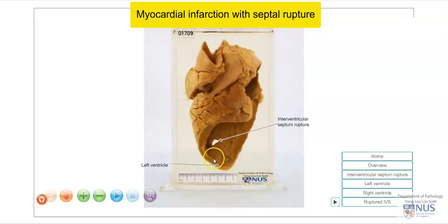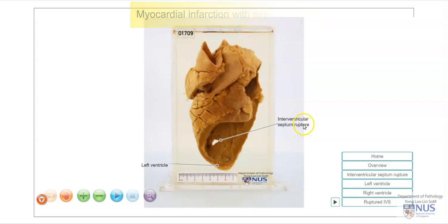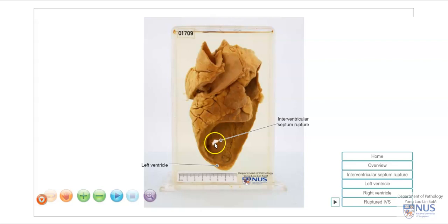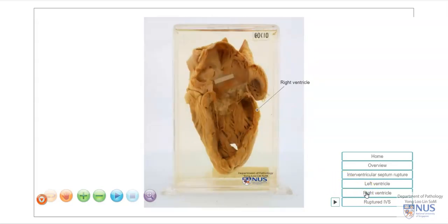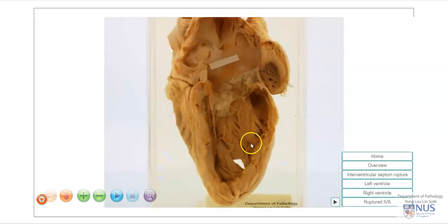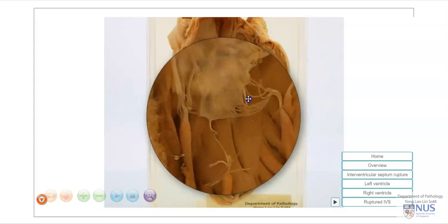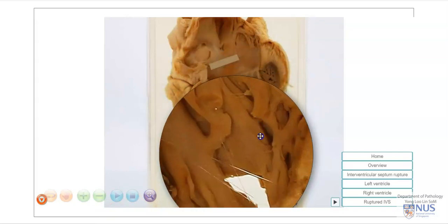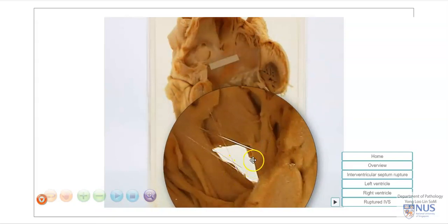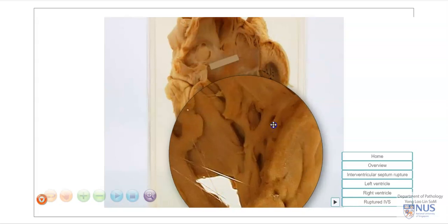Here we can see the left ventricle, and here is the area of rupture of the interventricular septum with a full thickness defect leading to the right ventricle. This is the right ventricle posteriorly, and we can see that the wall is much thinner. Let me just magnify this area of the defect — here is the rupture.